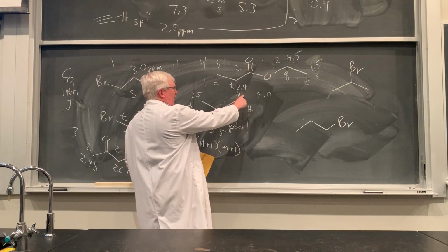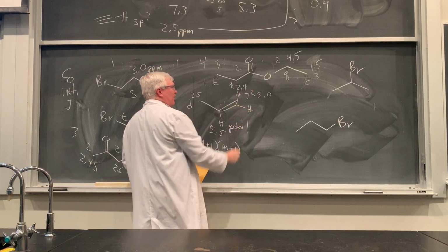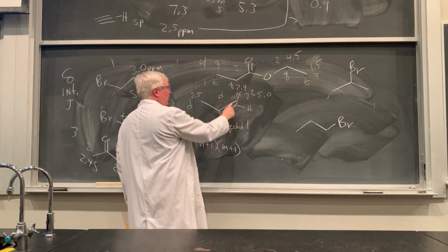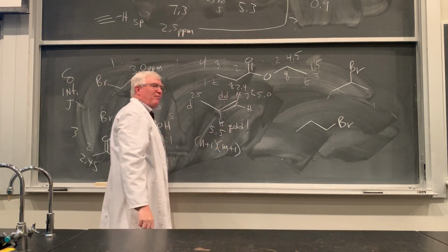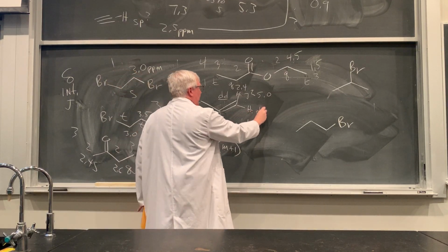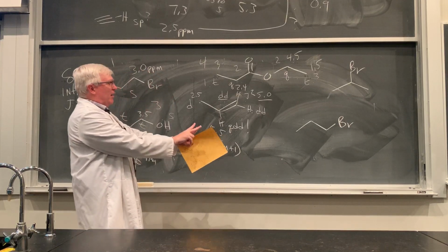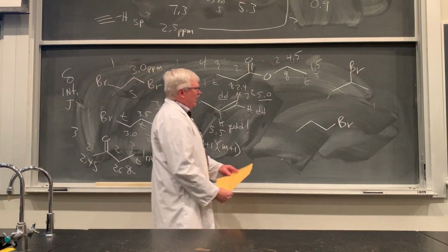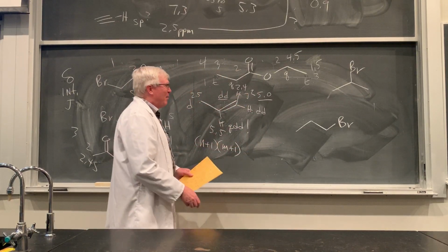Now what about this one here? Well, it's got this one next door. That's a J2 coupling through 2 bonds. And because they're different, you see J2 coupling. It'll be a doublet. And it's also coupled here vicinally, J3, a doublet of doublets for that guy. It's not triplets, not coupled to that guy. Same thing for this one, doublet of doublets. Sometimes they're right on top of each other, and you'll just see a bigger signal there. We'll look at some examples that'll help you out there. This one's a little more straightforward, you could say, but watch out. The coupling here is a little complex.